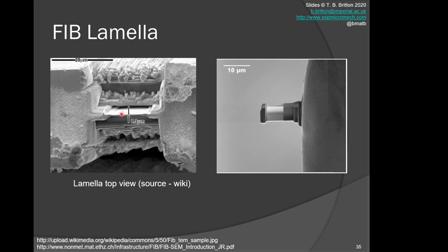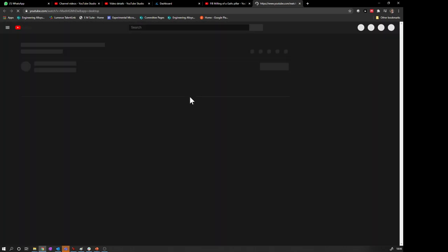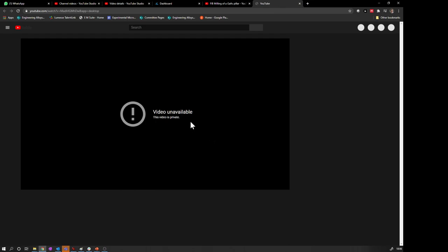Another example is creating a FIB lamellar from a site-specific region that has a constant thickness. What we do is we can cut out cross-sections from the top and the bottom. We can cut out a thin region—you'll see the operations in a second. We can then get it to be beautifully thin and stuck on a post that we can then put in the TEM. This example is a really nice video from TESCAN showing the operation steps.